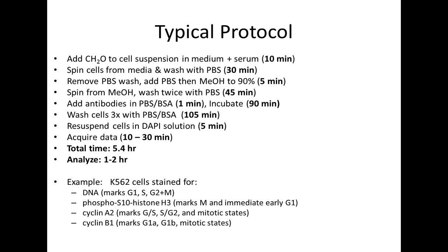Different markers are optimized by variations in this basic protocol. Since markers are intracellular, optimized staining requires time, which is 30 to 90 minutes depending on the desired data quality, with 90 minutes providing the highest signal-to-noise ratio. Further, after antibody incubation, 3 washes at 15 minutes each plus centrifuge time are optimal.